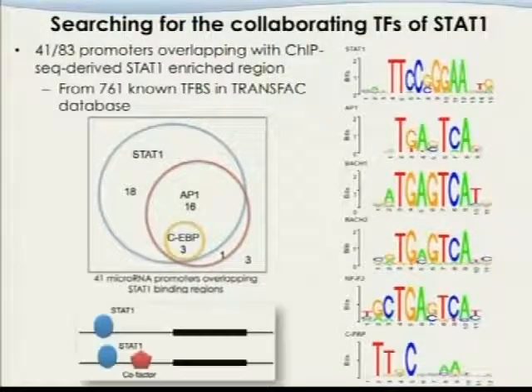Okay, so what this really suggested is both these 2 models worked. Remember, there's another one where there's a cofactor in the STAT1 sitting on top of it. We haven't seen that. If that occurred, we should be able to see the AP1 binding sites in those regions and no STAT1 binding sites. But eventually, what we see is all the ones that AP1 is enriched in, we have STAT1. This really suggests that these 2 different types of model worked.